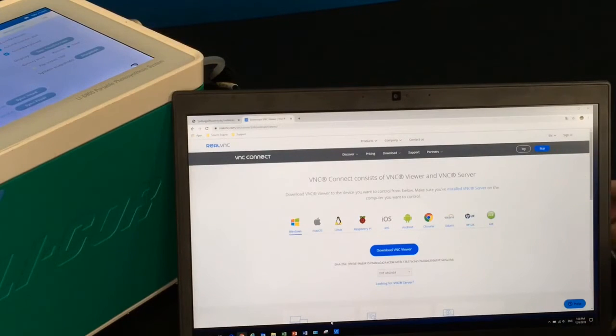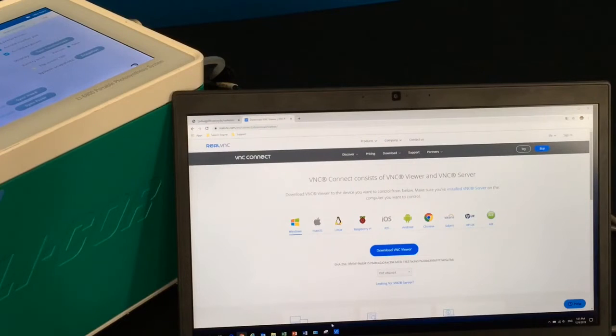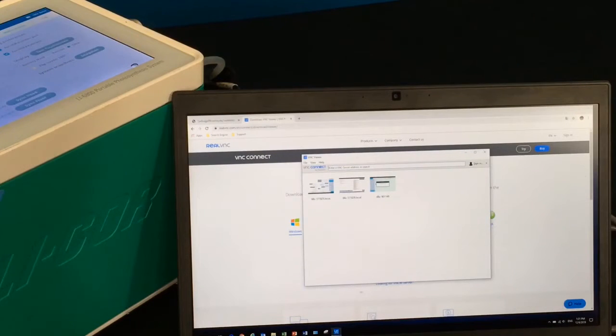Next, make sure you have your Ethernet cable to connect your instrument to your computer. Here I'm using a direct connection. I have finished the connection. Next, we will launch the VNC Viewer on your computer. You will see a search bar on the top of the VNC window. In the search bar, type in the host name of your instrument.